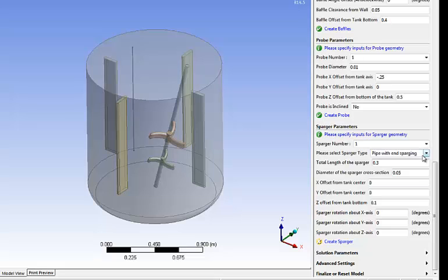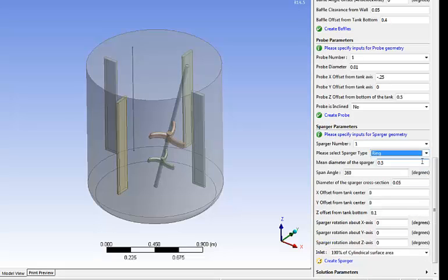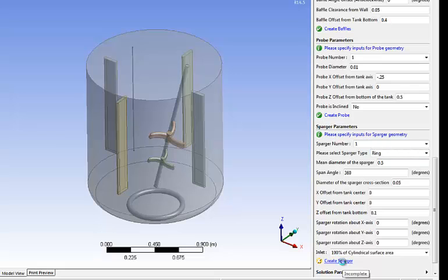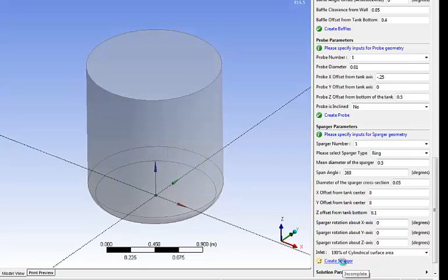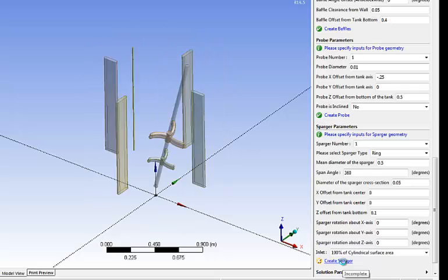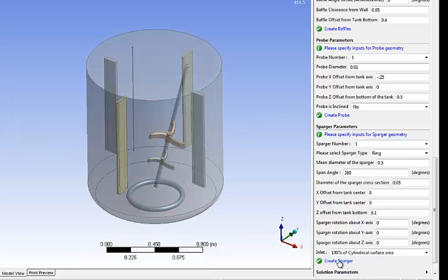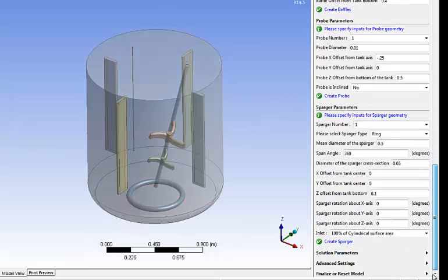Next thing is to set up the sparger. Same thing here. I have different options to create the sparger. I enter the dimension location and simply click create sparger. And here we have the full geometry.